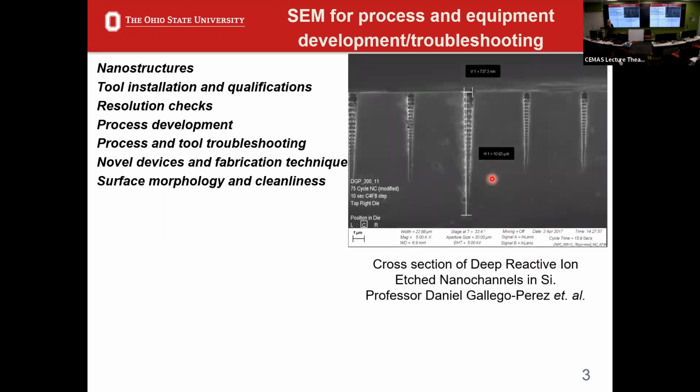Really the heart and soul of what we use SEM for in our lab is for process development and troubleshooting. This is work done by Professor Daniel Gallego-Perez and his group. He's in surgery jointly with BME, and they're doing basically drug delivery therapeutics on the nano and micro scale. And they're looking at basically their process, how well these materials are open. These are actually nano channels. They're one side of a device that open to another side that's on the micro scale. So they're looking at these in cross section.